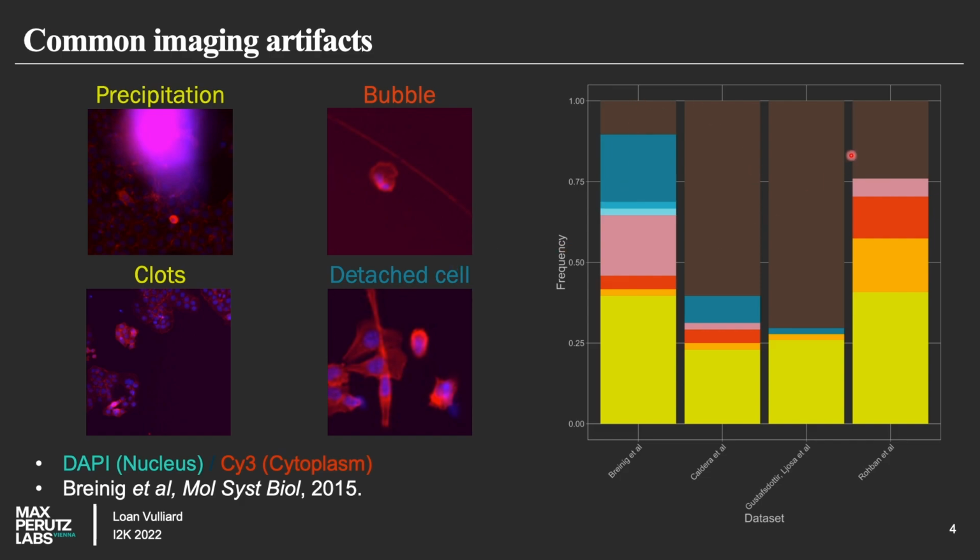And this tends to be uncommon in some screens. So this is happening really with even the best experimental setups, and does not always mean that we have to completely discard the images. But the key message here is that we always end up with some contamination in our data and that we must deal with it somehow.